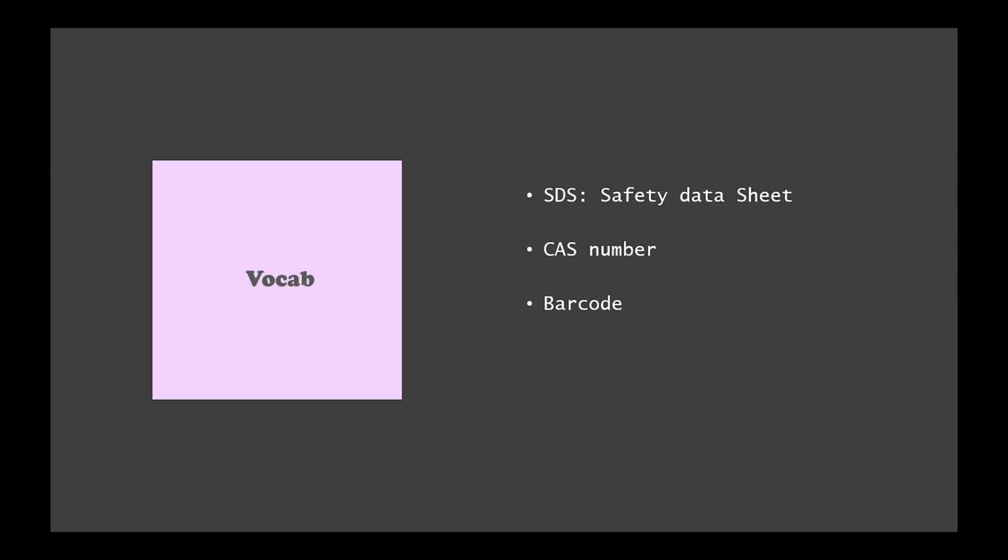There are many types of barcodes, but the most common one is Code 128, which is the one that I will be using because Excel can change a set of numbers into Code 128 through an added font.